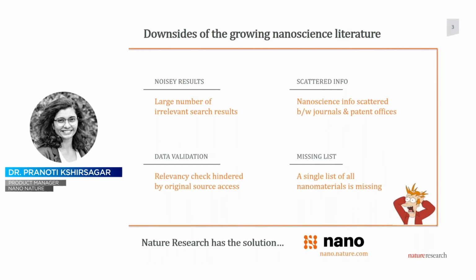It's also being used extensively by researchers all around the world, and we hear really kind words about how much Nano is helping scientists like you in going about your research.